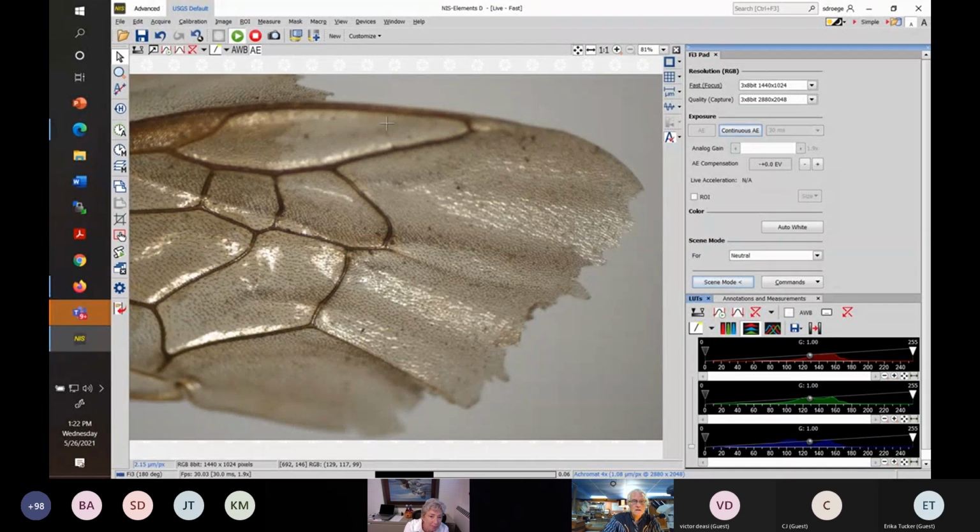Okay, here's the margin. This is probably the hind wing sticking out behind. This is the stigma, this dark area. We're not going to talk about that per se, but it's usually right there in some form. Marginal cell. Here's a little clipped end, which in some species is diagnostic, versus an end that dives right into the edge of the margin.